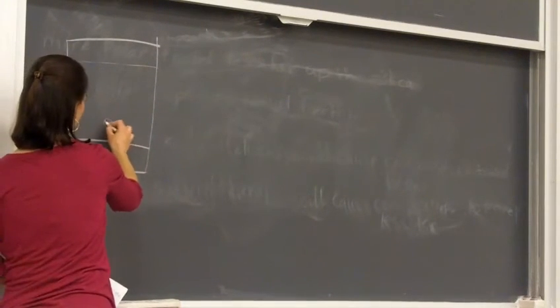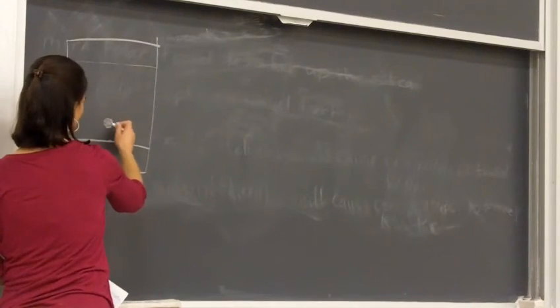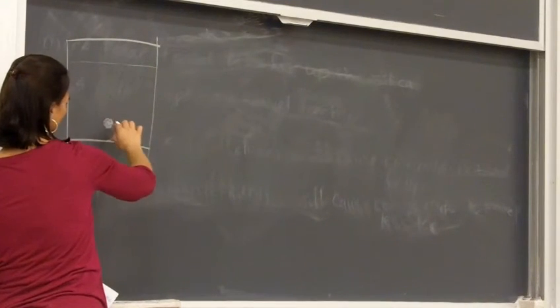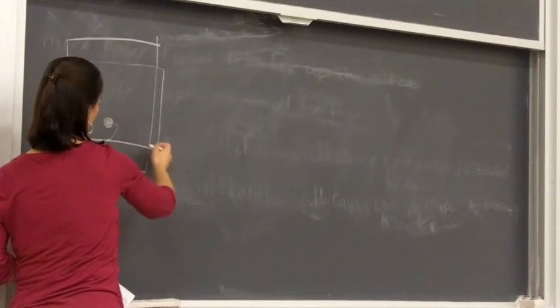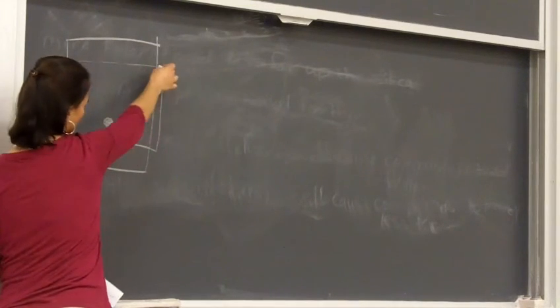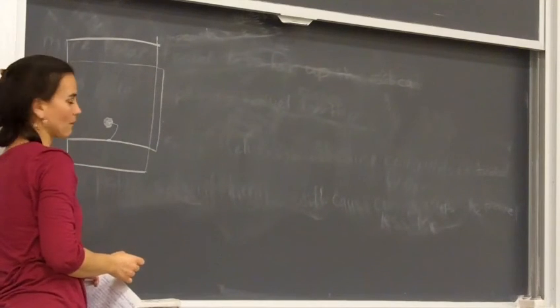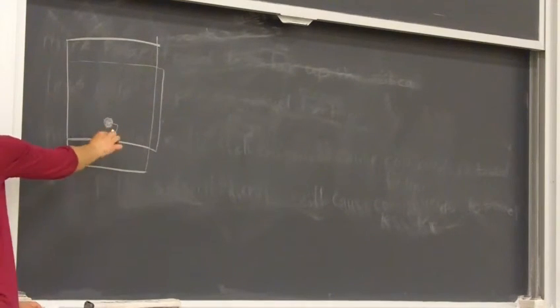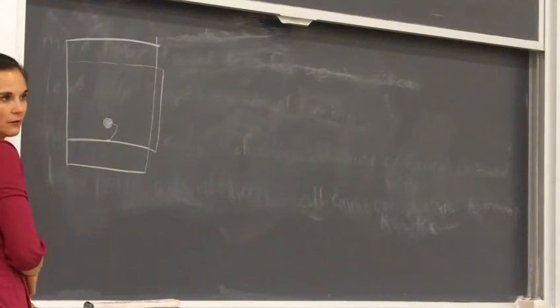And when you are measuring for the RF value, always measure into the center of the spot. So this over this would be our distance traveled from the origin to the spot, and then here to here would be our distance traveled from the origin to the end of the solvent, okay, for calculating. So we use this number and this number for calculating RF value, okay? So we've got this spot on the TLC plate that's kind of running close to the baseline. You don't want spots really hugging the very bottom of the baseline to be able to figure out what's going on, because sometimes other things can be hiding in there, okay?